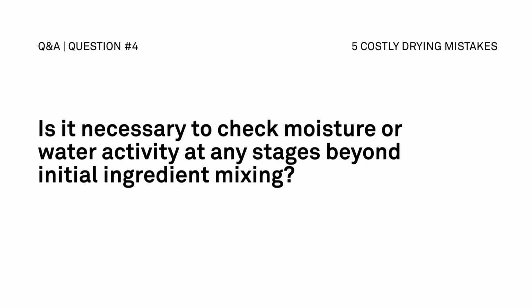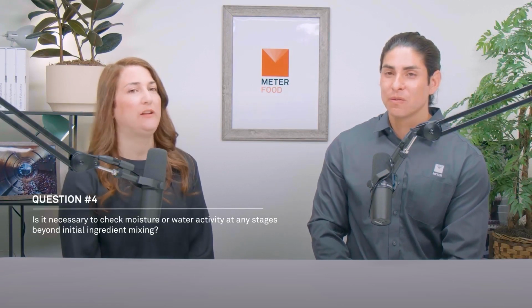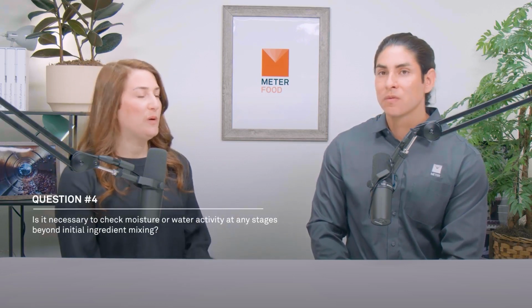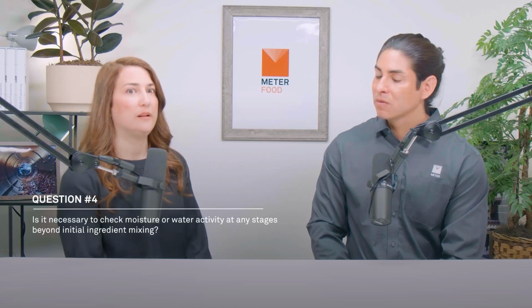So I think we have time for one last question here. This last one says, is it necessary to check moisture or water activity at any stage beyond initial ingredient mixing? Yes, definitely. I recommend water activity, as we've discussed, because moisture content isn't giving you the full picture to be able to avoid some of the problems that we've talked about. And then the process control, you can achieve that a lot better with water activity. And it's good to test the incoming ingredients, but post is also very valuable, because then you'll know what you've produced. Is it at the level that you are expecting?